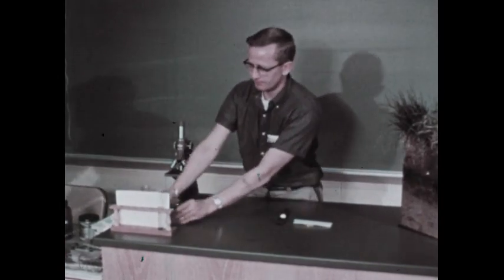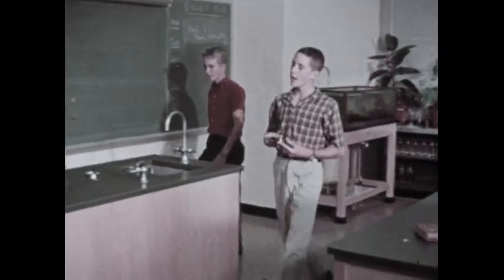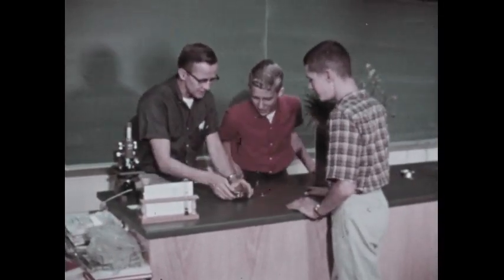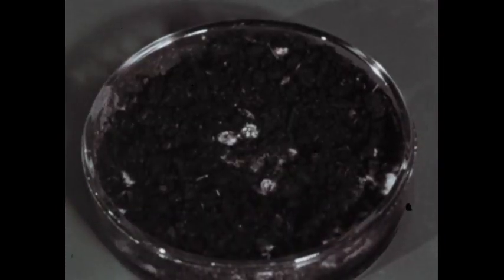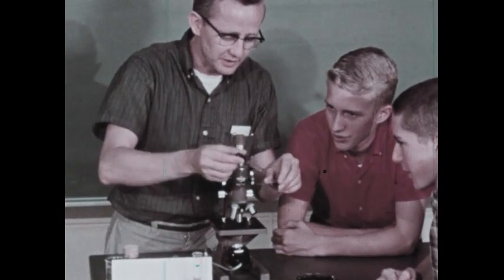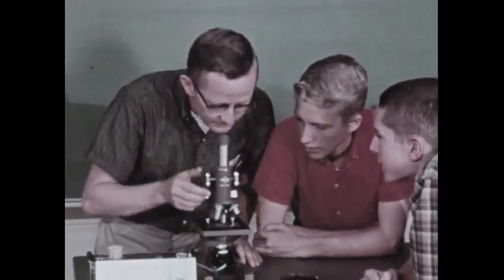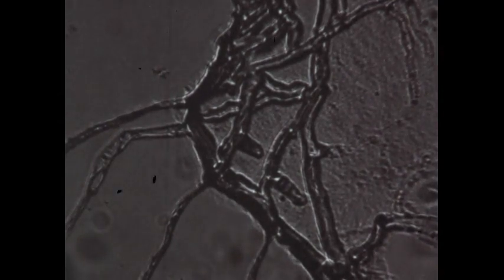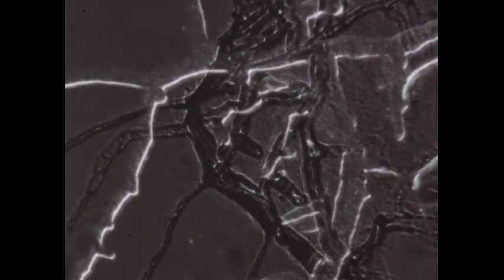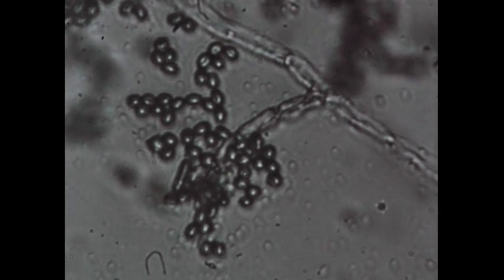Now we would like to find whether there is evidence of other living things in the soil. Several days ago, these boys placed some moist humus in a petri dish. Here's what grew on the surface: a mold. If we investigate a sample of this simple plant under a microscope, what can we see? We notice that the mold is made up of a mass of thread-like stems called hyphae. The growing hyphae of many molds enter the organic matter in the soil and help break it down. The penicillium mold is sometimes found in soil, too. It is the source of a very useful antibiotic, penicillin.